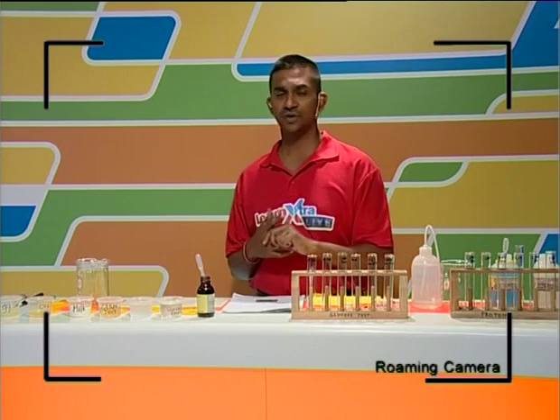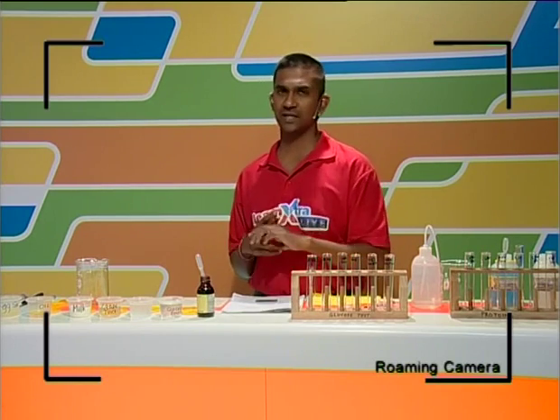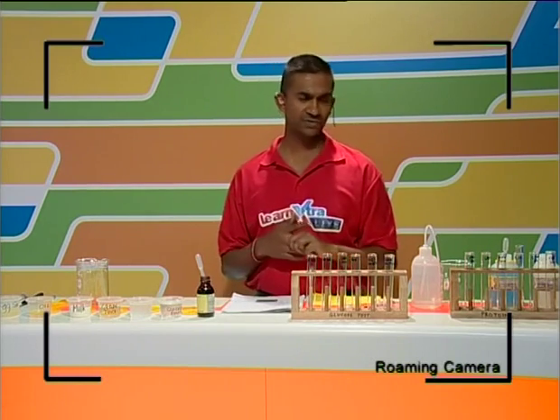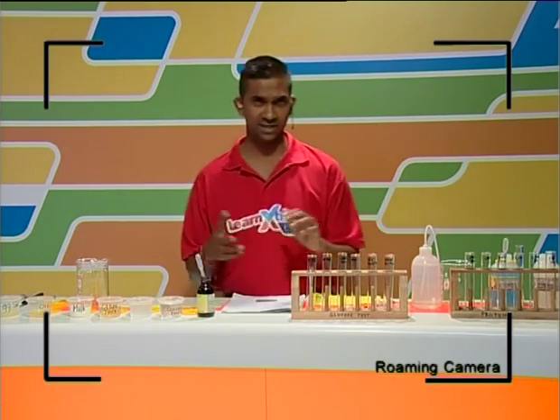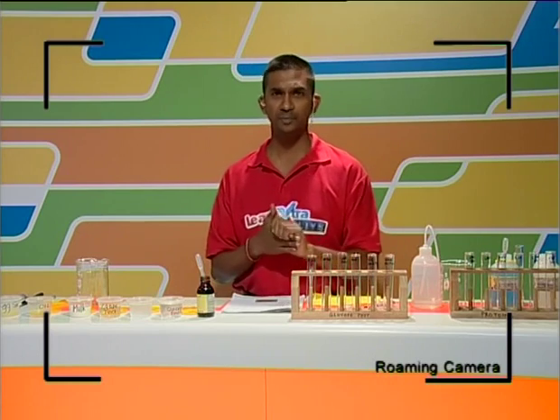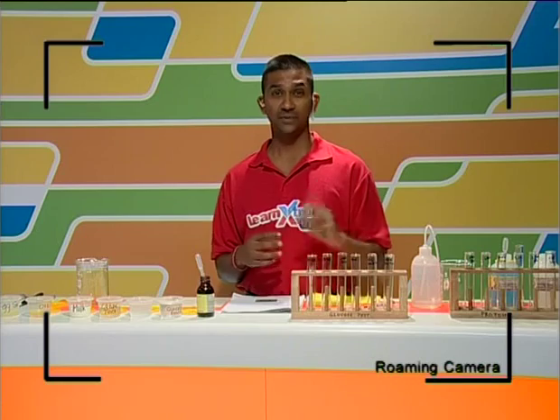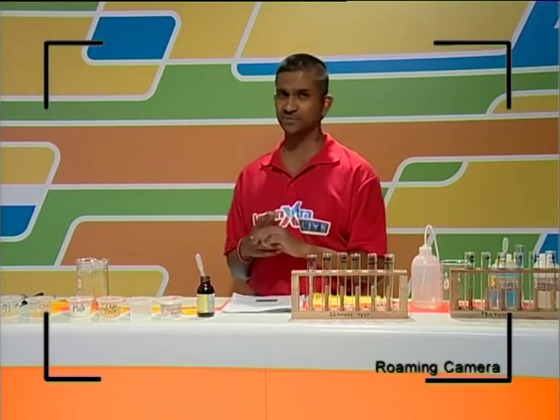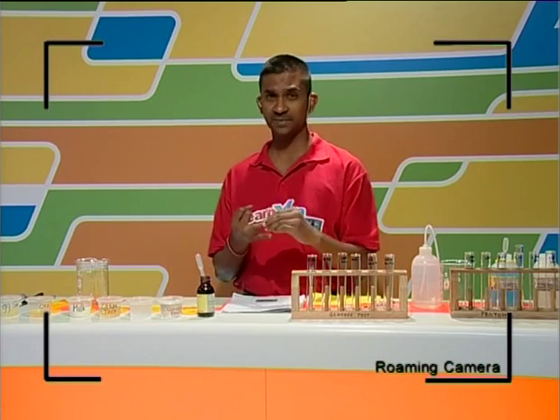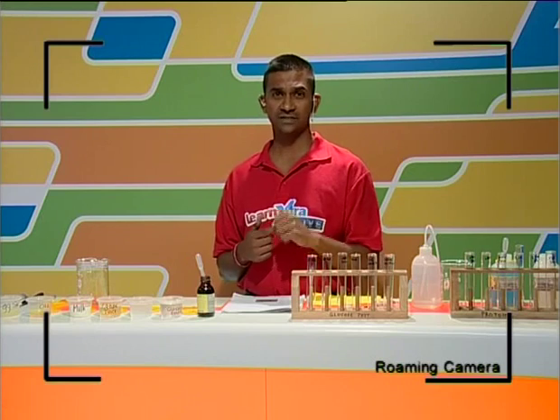Today, we're looking at the organic compounds, but we're looking specifically at testing for the presence of organic groups in different food samples. I'm probably going to do about 4 experiments by the end of the session. So we're going to have a power-packed session of 4 experiments where we're going to look at different food samples and test them out. Just to very quickly flash back, we discussed the 4 groups last week. We said they were proteins, lipids, carbohydrates, and obviously we looked at the vitamins.